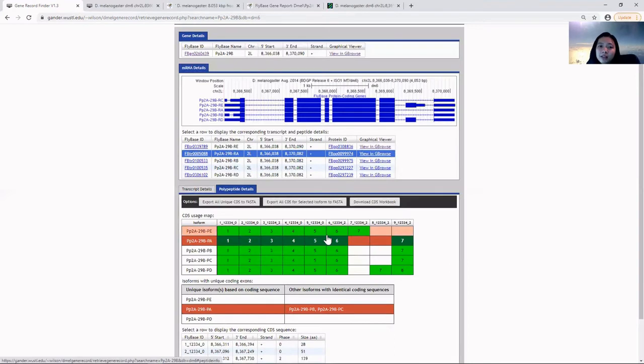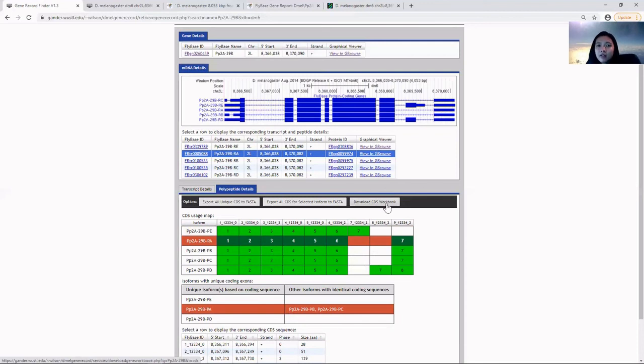You may find the CDS workbook useful when doing analysis, which is found in the options right here. Click to download and save the Excel spreadsheet on your computer.